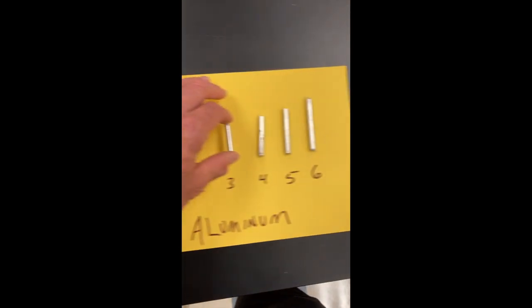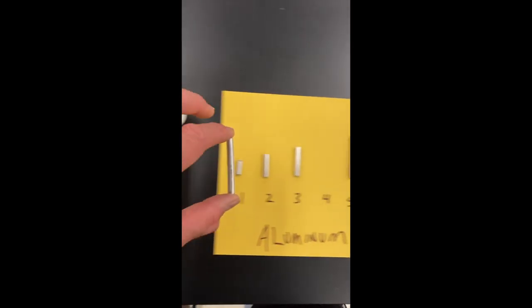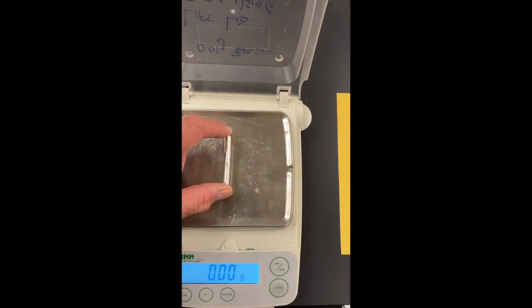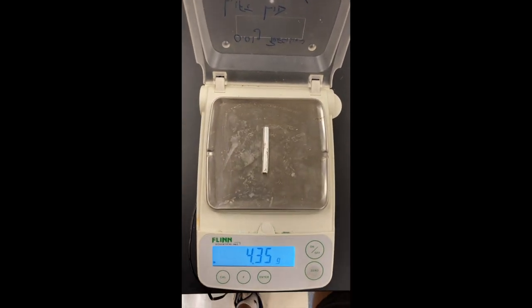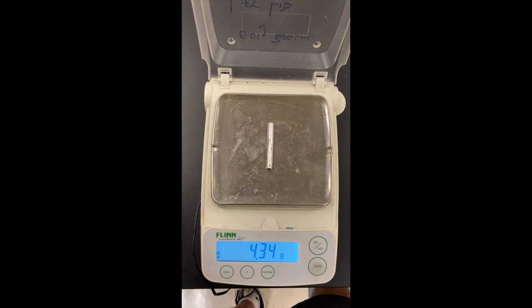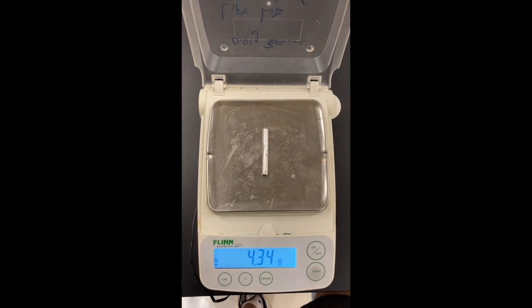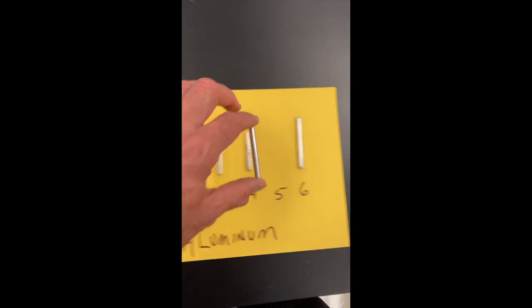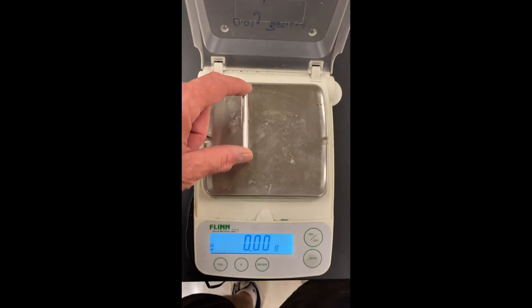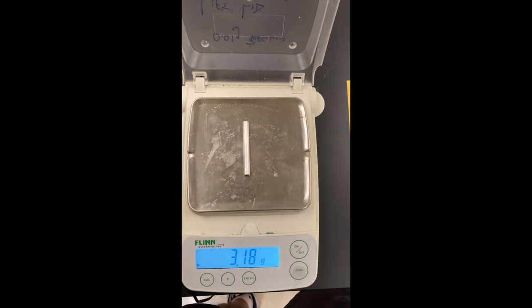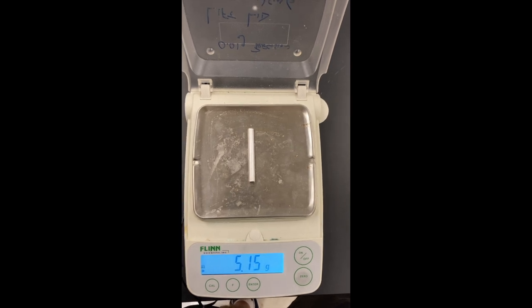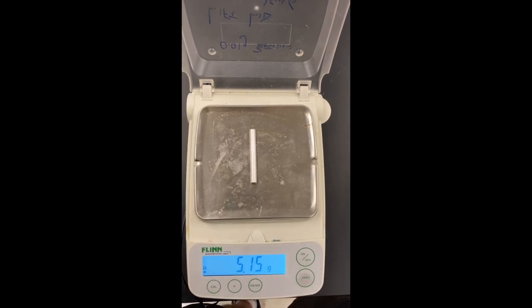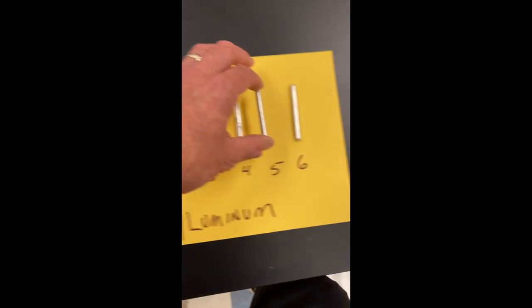Piece number four. If at any point I'm moving too fast, feel free to pause the video, but this is the mass of piece number four. Get piece number five, check to see our scale is zero. Piece number five has this mass, and last but not least, piece number six.